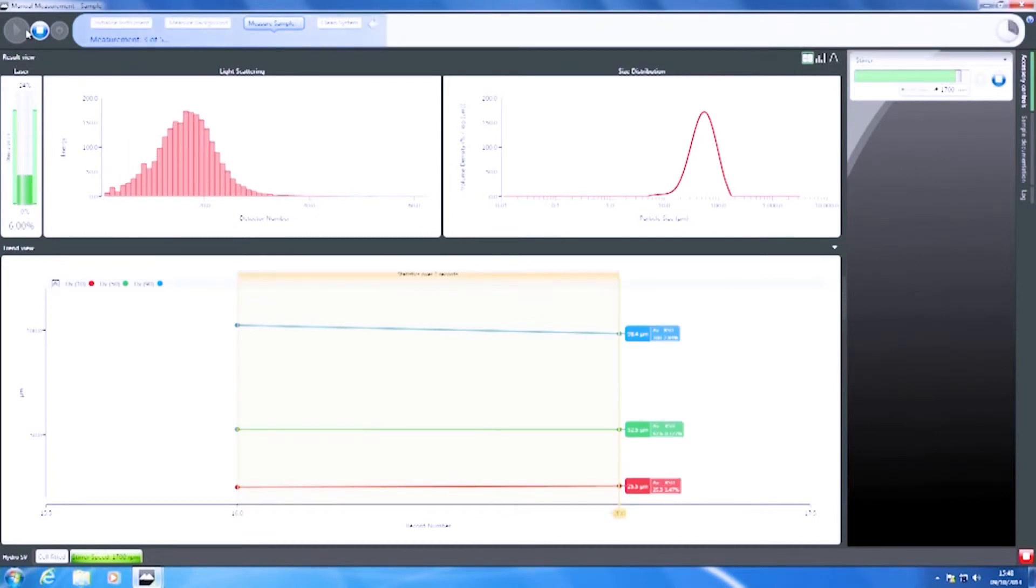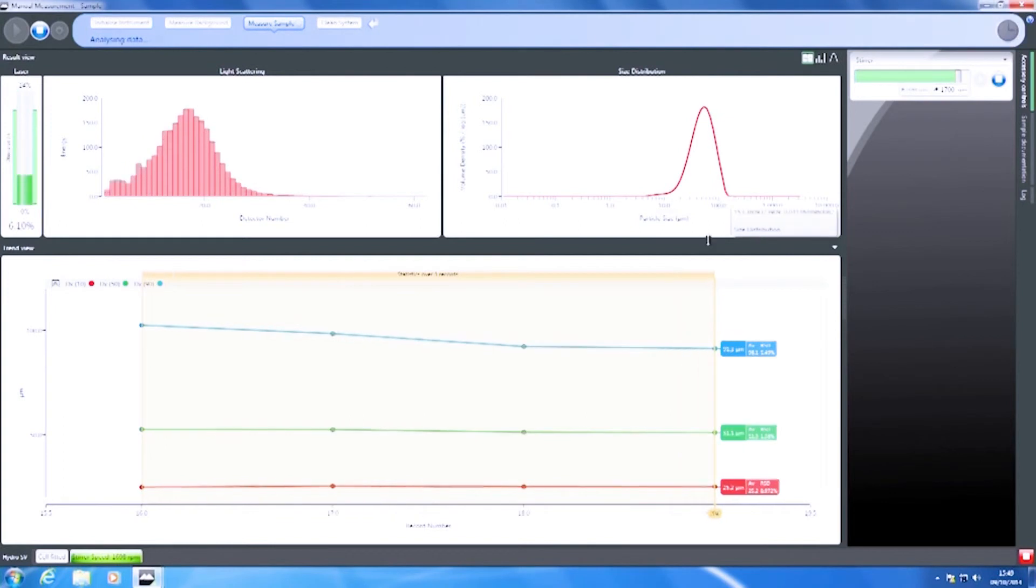What was the size of this sample, Anne? So, it's about 50 micron D50, the median particle size, but you can see on here we've got particles up to nearly 200 micron in size. And what we're looking at is the trend view to see that the particle size remains nice and stable.